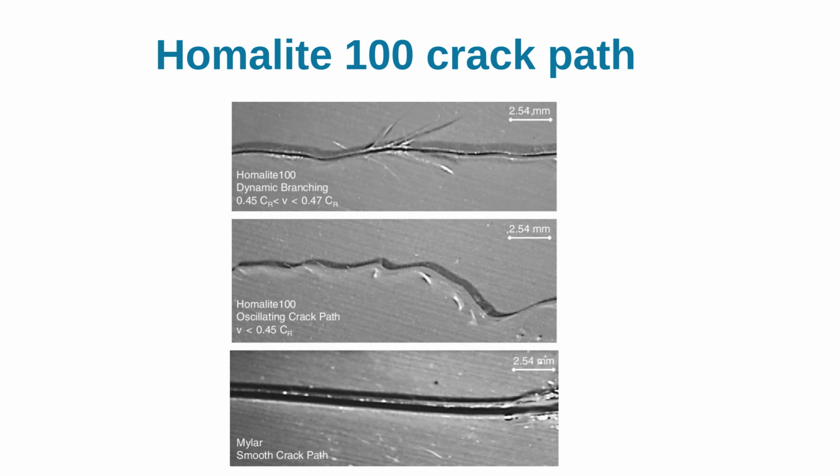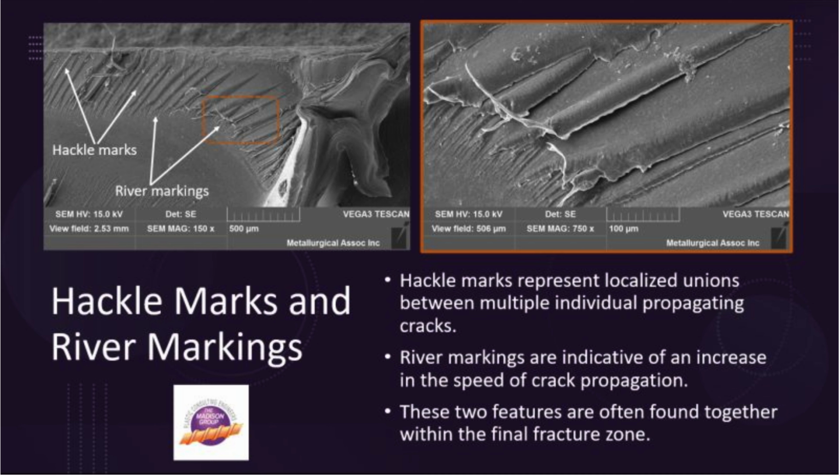During the rapid propagation of the crack, the fracture surface is known as a hackle zone. This zone is chaotic in terms of roughness. Microbranches, as the origin of non-trivial roughness, develop from a critical speed. Between these two zones, initiation and propagation, there is an intermediate zone called mist.